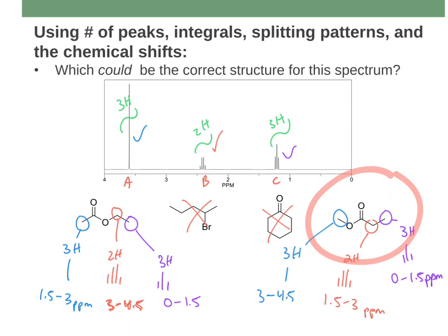So speaking of practice, I'm going to make another video where we just practice and look at like 4 or 5 different spectra and interpret them and see if we can get all of these 4 factors, the signals, the integrations, the splitting patterns, and the chemical shifts, to all make sense and tell us what a structure is.